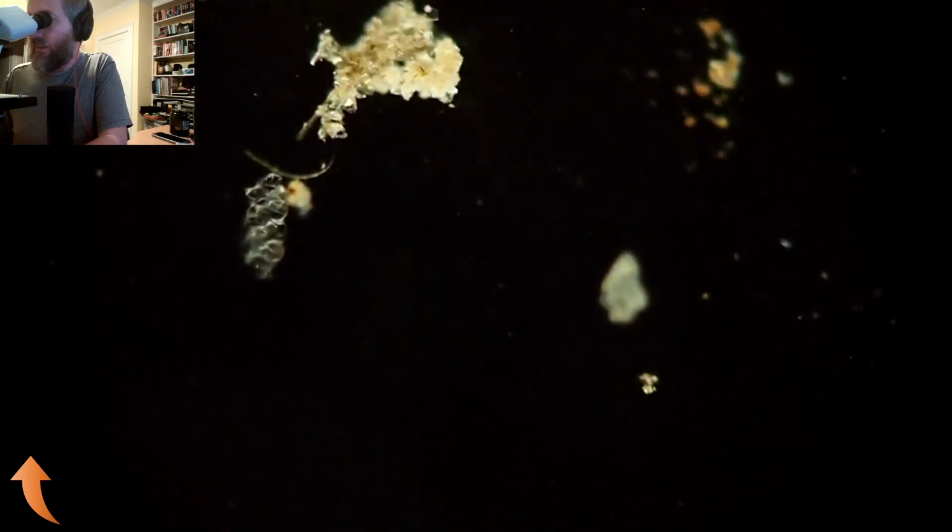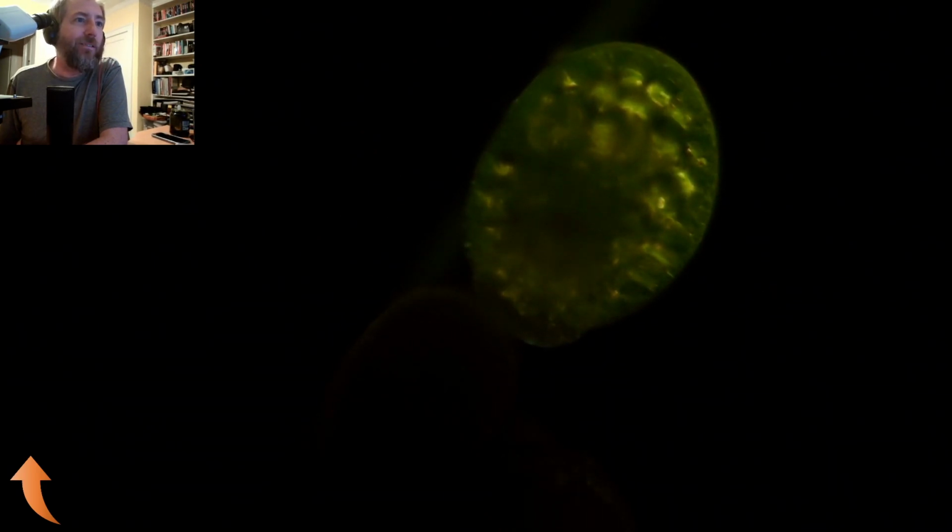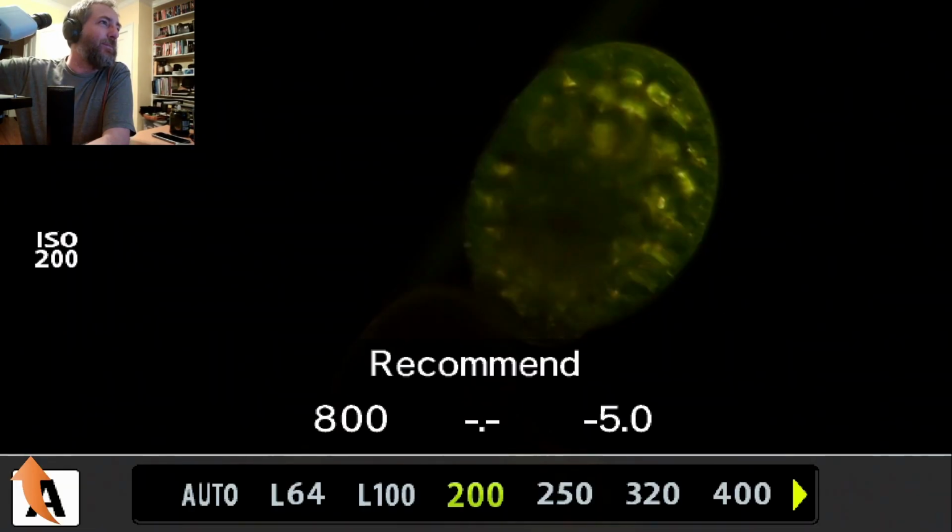Fast-moving things are possible to keep up with. Way off in the corner. These green blobs you see are duckweed, Lemna. And I just wanted to sort of take a look at some.